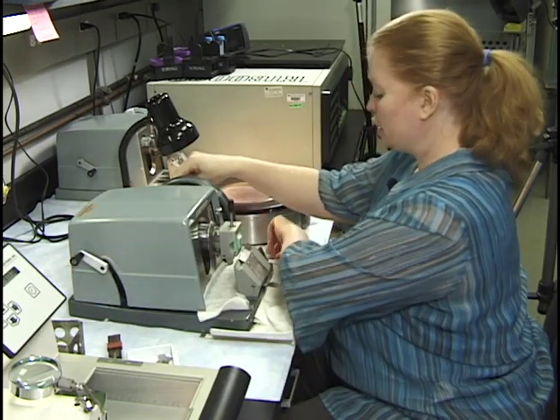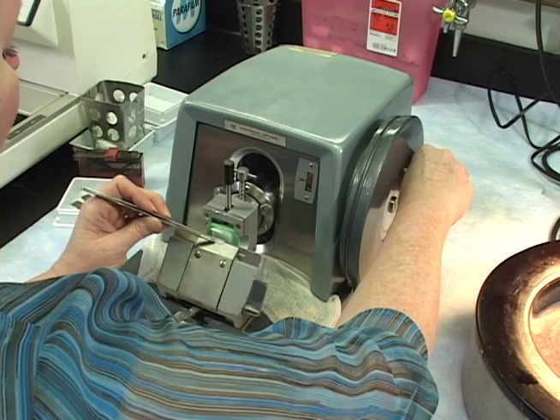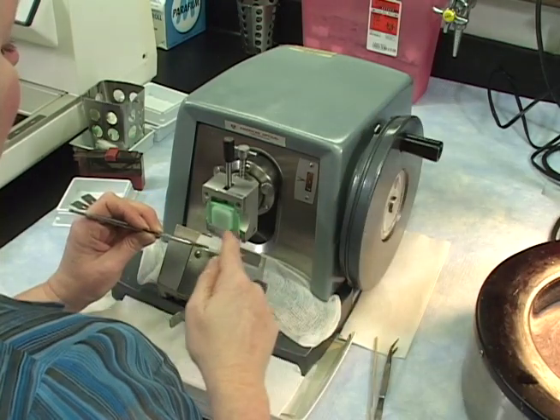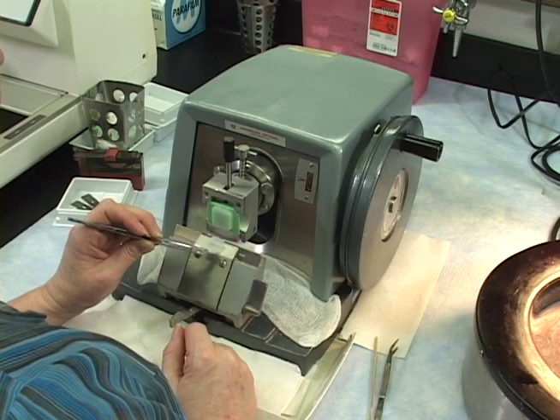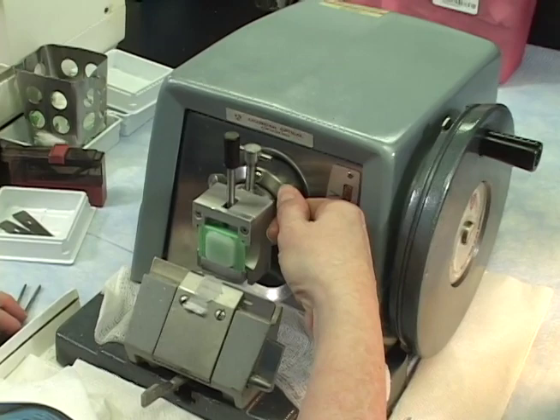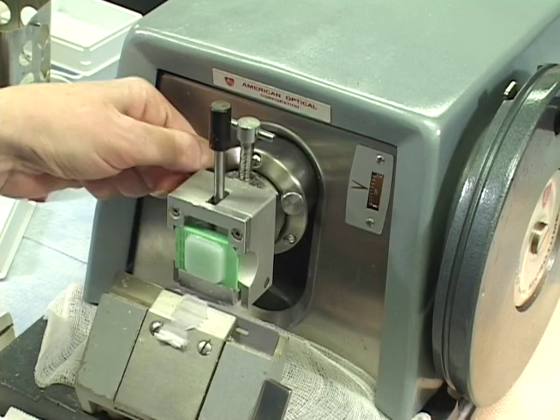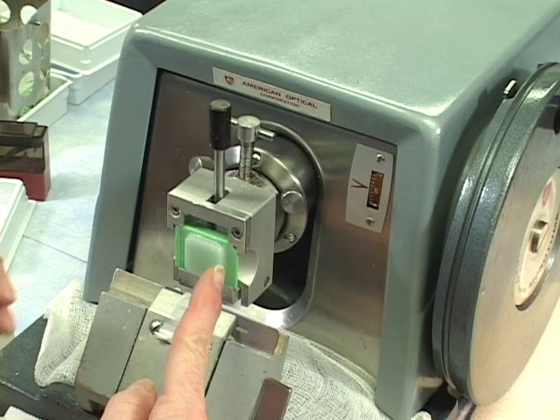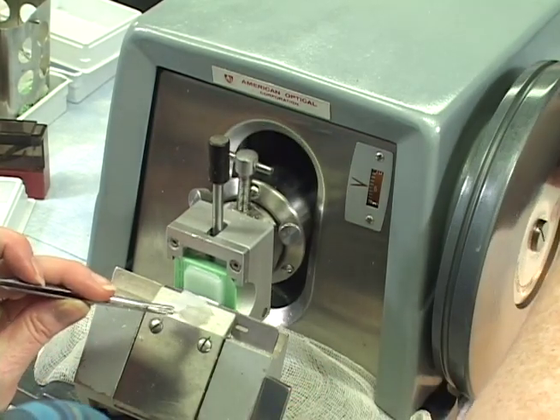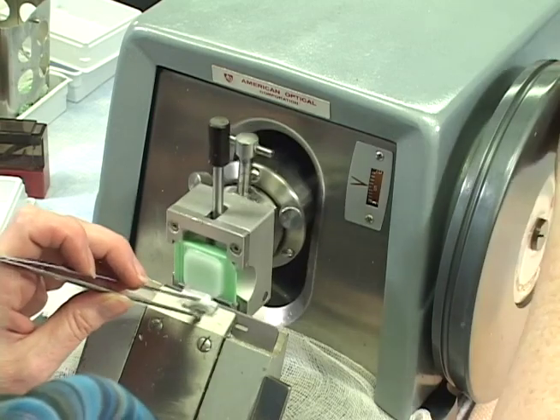Now I can see that this particular block is wanting to go, and use forceps. Do not use your fingers to grab this paraffin. Now I can see it's cutting this left side before it's getting the right side. So what I'm going to want to do is give it a little tilt. How I'm going to do that is I'm going to slightly loosen this one, and I'm going to tighten this one. That is going to bring this right edge out a little bit more. Let's see how that works. And a little goes a long way with these things. And now you can see it's gone to the right side. And it didn't take much to do that, as you saw.